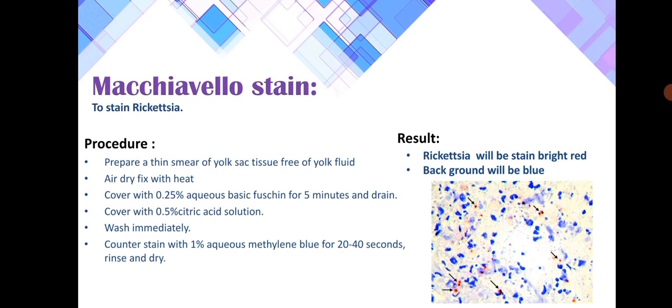Machiavello stain is used to stain rickettsia. As a result, the rickettsia will be stained bright red and the background will be blue.